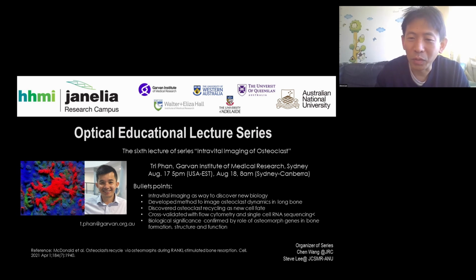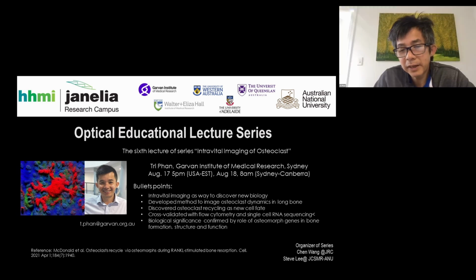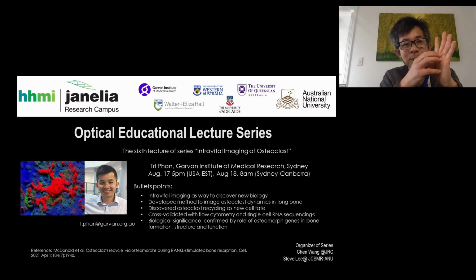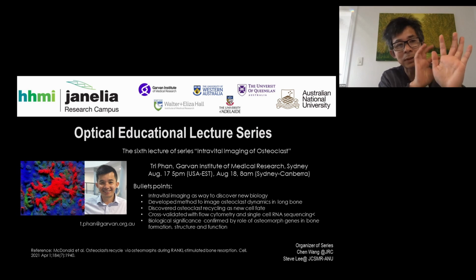I guess we maybe a little bit that we're looking at megakaryocytes in bone, actually. And one of the things that Liz is extremely interested in. Have you guys looked at that yourself? Yes, so megakaryocytes are really interesting because, Uli von Andrian about 10 years ago, using that method for skull imaging, imaged these megakaryocytes sitting next to a blood vessel and pinching off the platelets.